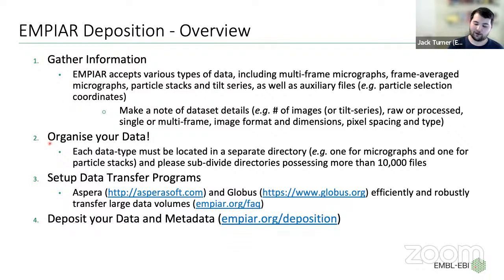Organize your data. So the way that you organize your data on your system in the file structure will be the organization that is then presented on the EMPIAR website. So make sure that you've got everything in their own folders as in where you want them. If you want each tomogram in their own folder, for example, put them each in their own folder and label those folders appropriately.